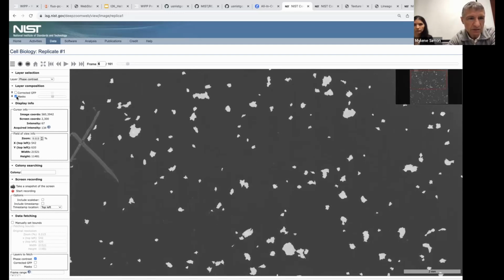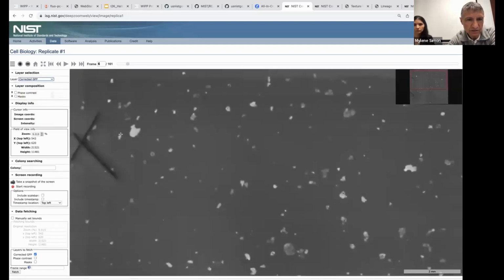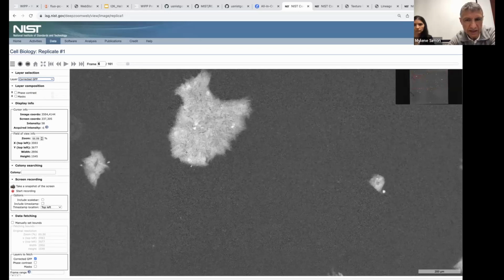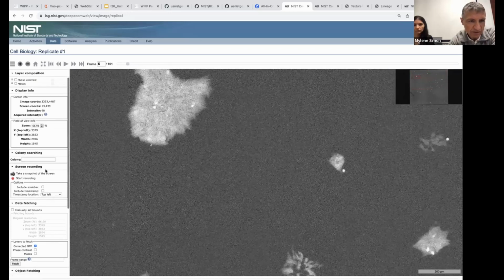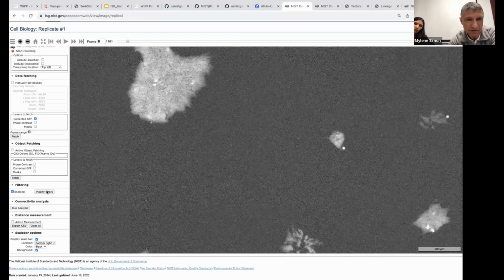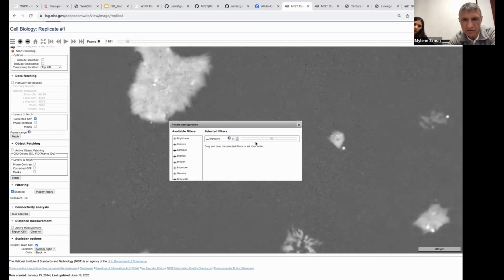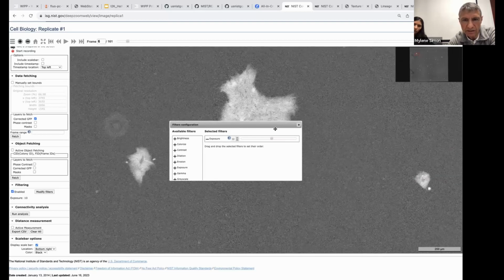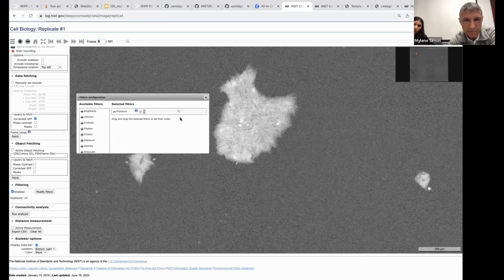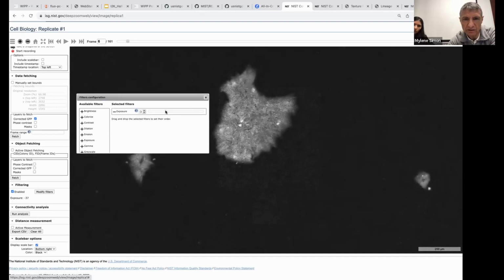Many times when you are doing explorations, the image might have low contrast. So you want to look at the images and enhance the contrast, or do some other enhancement. So we provide you in browser different filters. For example, here we can say increase exposure. So now if I look at this particular colony, I can increase exposure or decrease exposure.